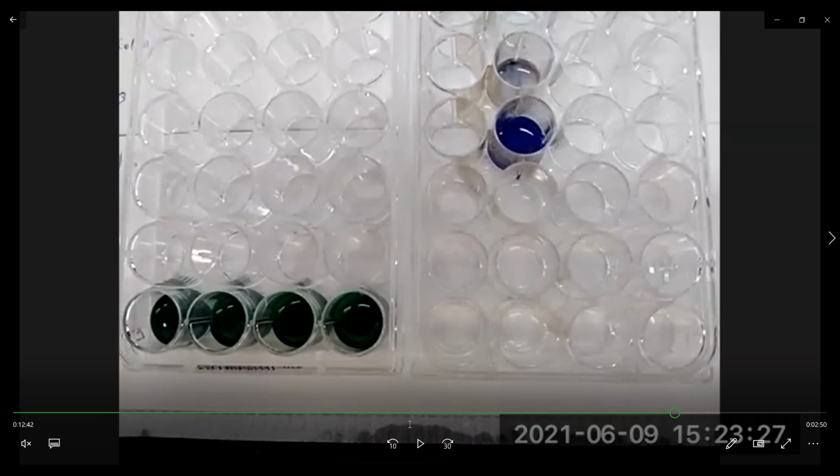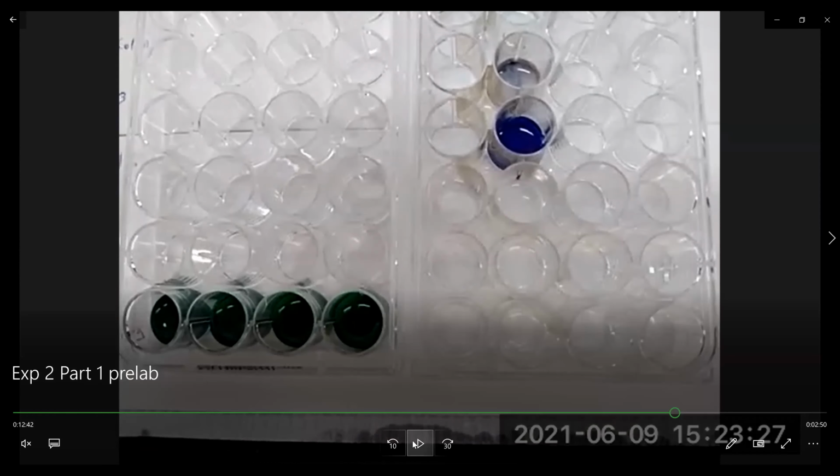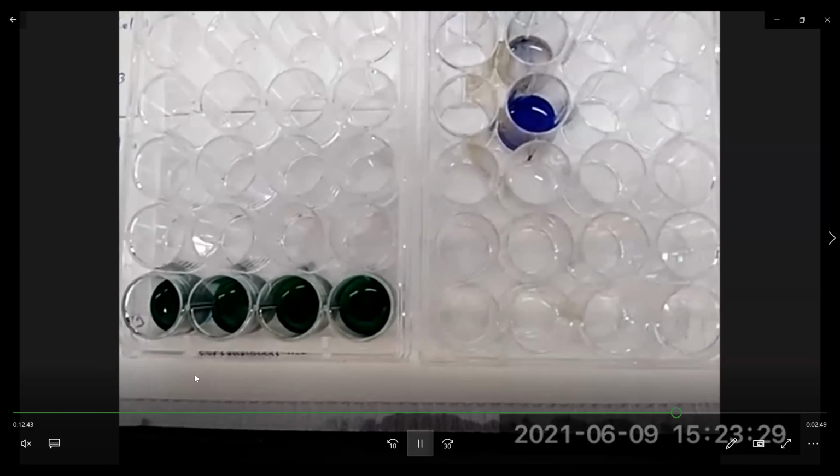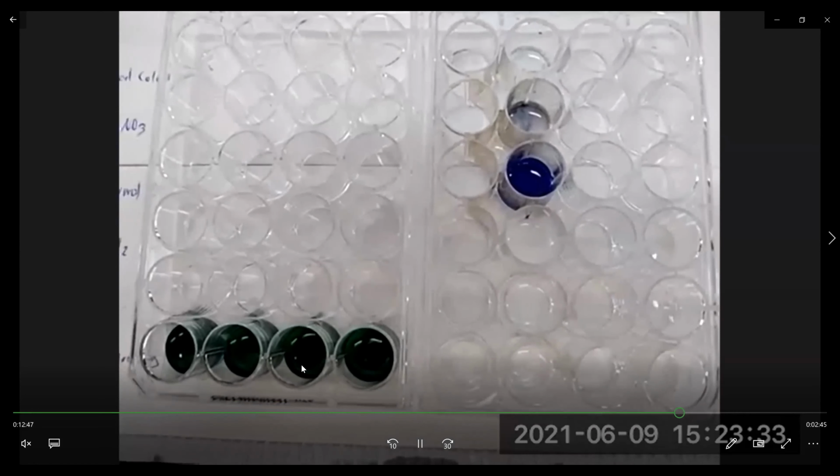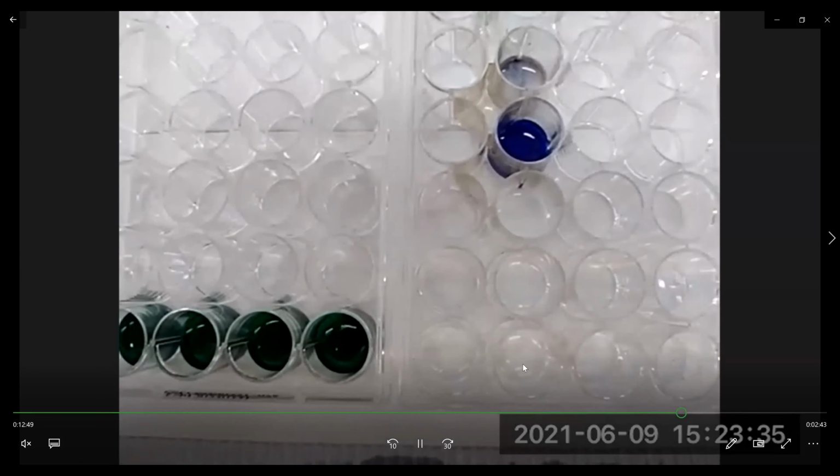And lastly, we're going to add green food coloring to the Drano. Again, disregard the lower part. We had an accident with the green food coloring with the household reagents.